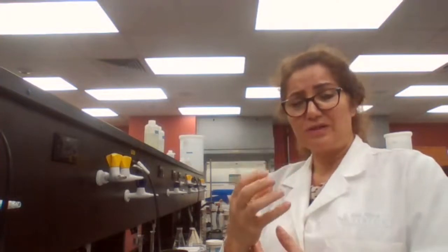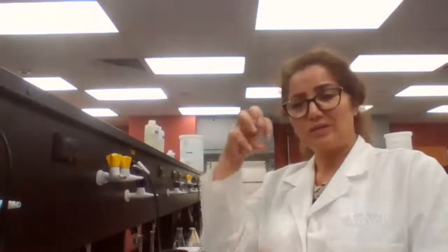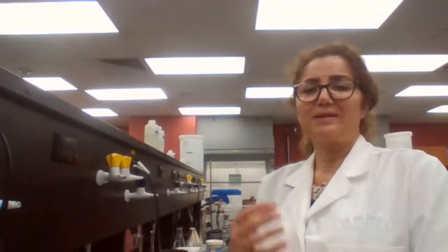And if you have large crystals, based on what you have read in the experiment, in the last step, we have a vacuum filtration. For the vacuum filtration, if you have precipitate, which is a small size of crystals, the compound is going to get stuck in the openings of the filter paper. It doesn't go through easily. It would take longer, and the drying part is going to take longer. But if you have large crystals, filtration is much easier and more efficient, and solvent is removed entirely. Drying of the sample is going to be easier.